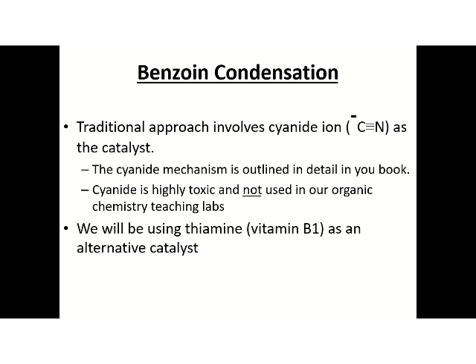Despite that, this cyanide mechanism is outlined in detail in your book, so you may go there and study that mechanism, since it can be asked in the final exam or in any kind of exam that we do have. In this case, we will be using thiamine, which is vitamin B1, as an alternative catalyst, which is more natural and less toxic, so it's safer for us.